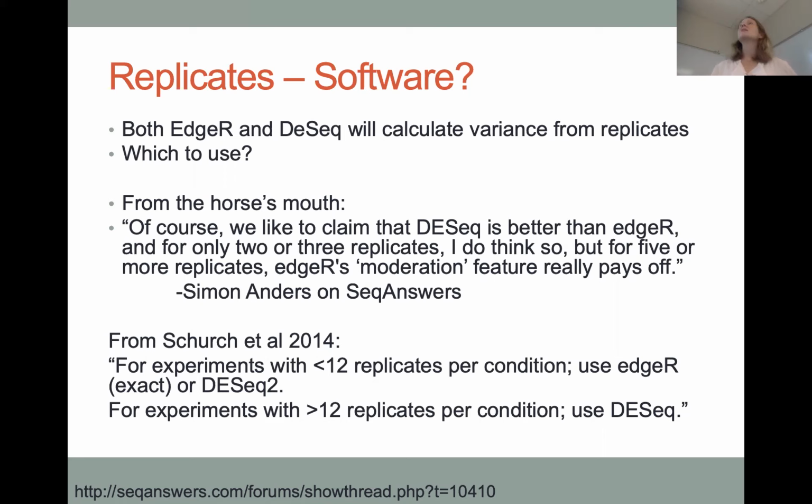Well, I've heard that the next big advance in RNA-seq is not going to be on the sequencing side. It's going to be on the library prep side. The library preps are going to drop from $150 to $30. However, I've been hearing that for 3 years and it hasn't actually happened. And I don't have a good enough understanding of what they're working on in the library prep side to know how it would be made that much more efficient. But somebody from a core facility in Texas told me that, and I keep calling him and he keeps saying, well, not yet.